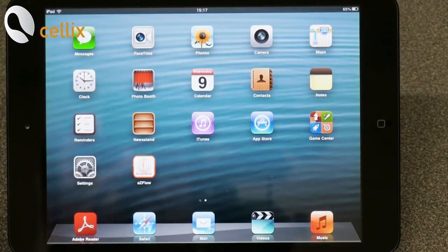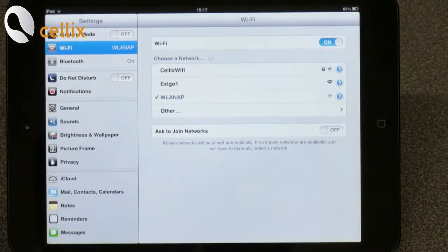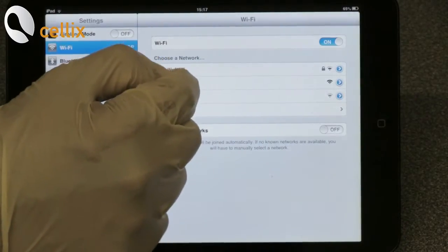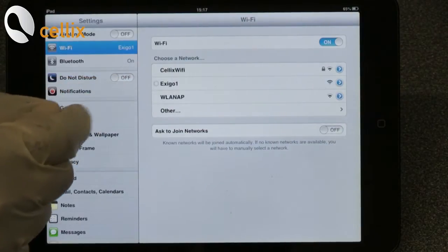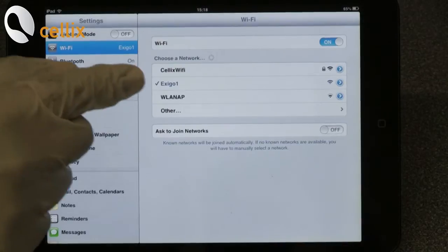Now we want to connect the Wi-Fi network of the ExiGo pump. For that you go to the settings, go to Wi-Fi and click Exigo1. Now it's connected.